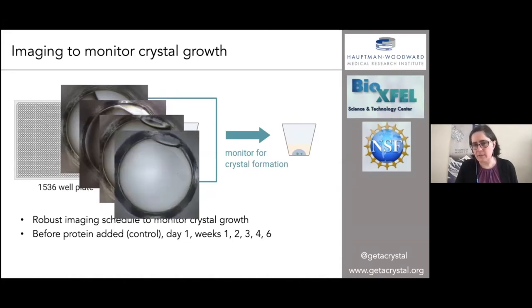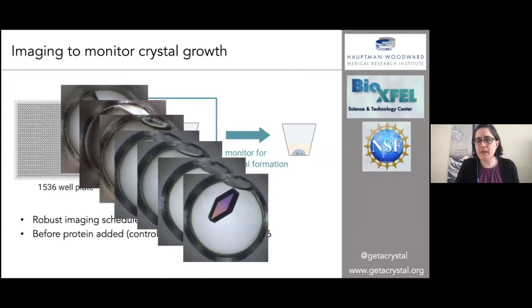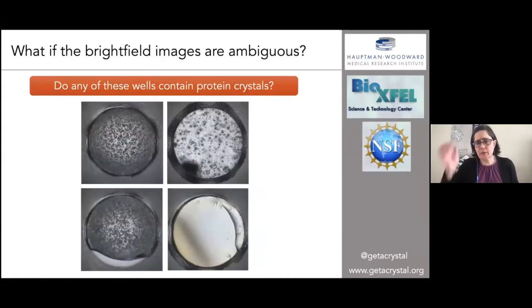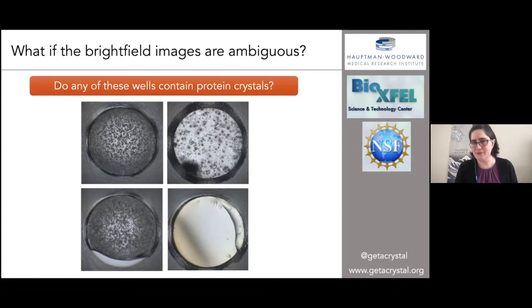When you've got 1536 wells, we watch over the course of six weeks — at day one, week one, week two, week three, and week four — and suddenly you have a really beautiful crystal that stays there at week six. One of the questions is: what if you can't actually see your crystals? What if your brightfield images are ambiguous? I want you to look at these wells and try to assess whether they contain protein crystals. All four of these wells actually contain protein crystals — they may not be the prettiest, but in some cases they're the only ones that formed even in the 1536 screen.